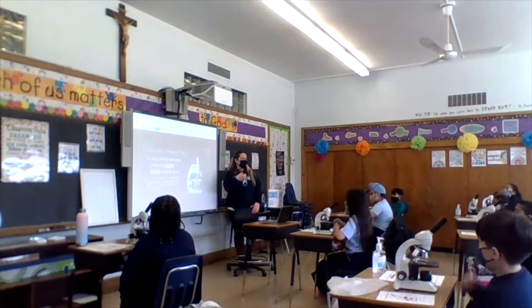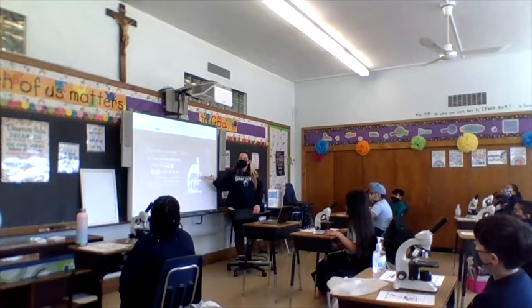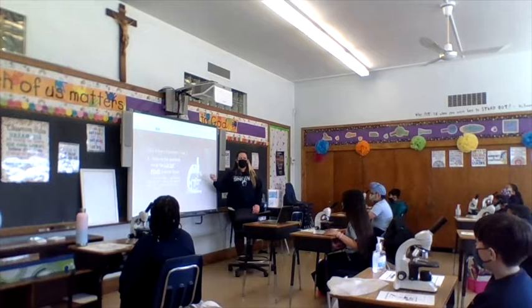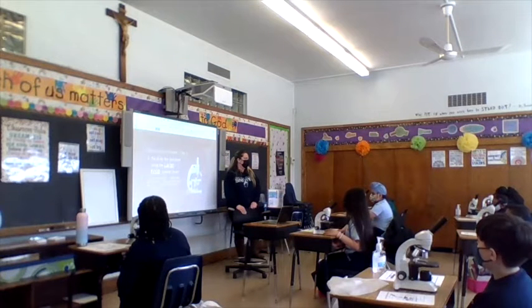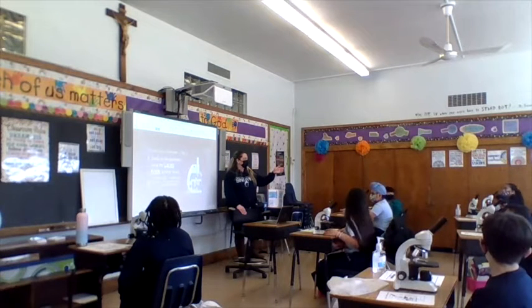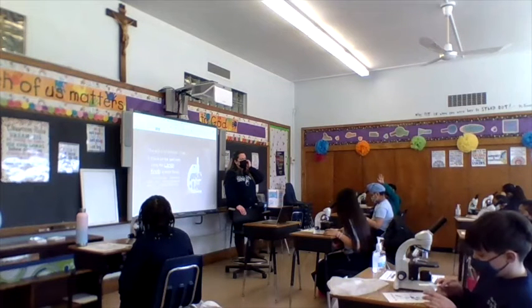First you start on the red one. Then they want you to use which knob? What was the vocabulary word we called it? Instead of large, what's the vocabulary word that we called it? It's on your chart at your seat. You can use your chart.